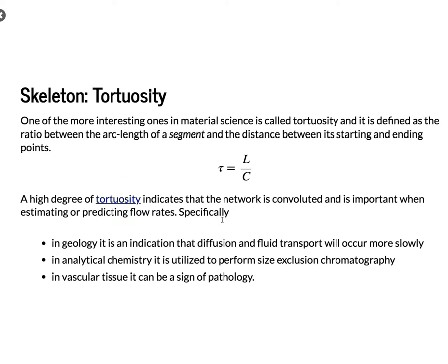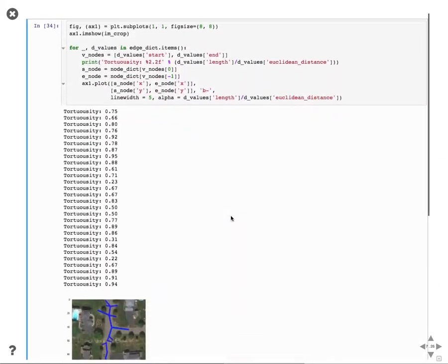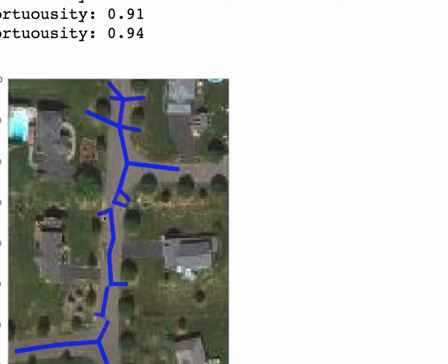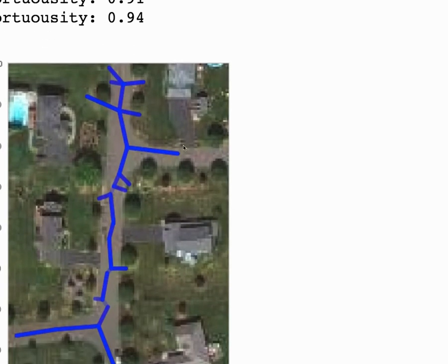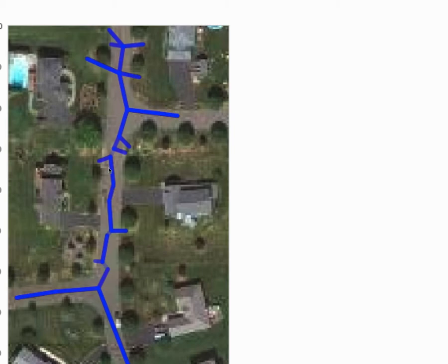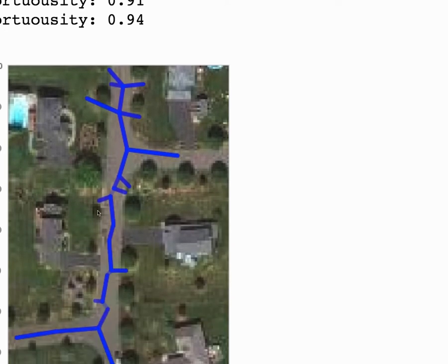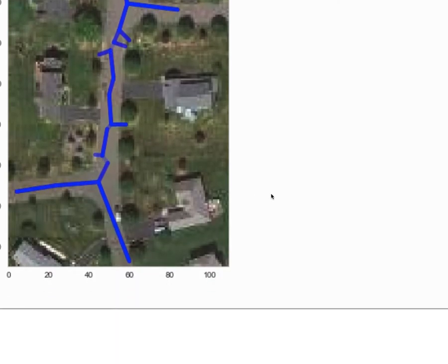So it's a metric that we can extract once we've established this kind of graph representation for what we're looking at. We can now do this for the image that we have and show for each node, by how transparent it is, the level of tortuosity. The very high ones appear very dark, and the very low ones don't appear very dark. For a roadmap, this isn't particularly interesting. We basically just see very tiny short segments of very low tortuosity compared to the other ones.